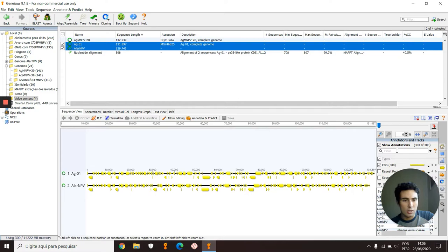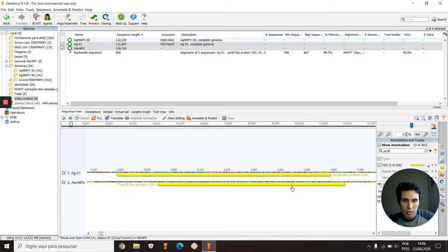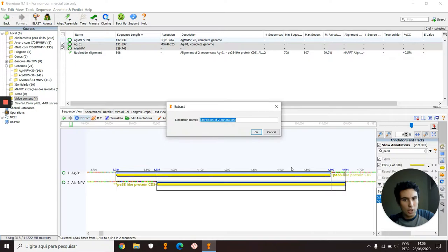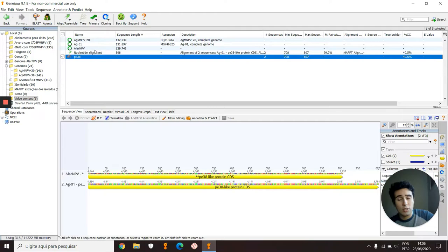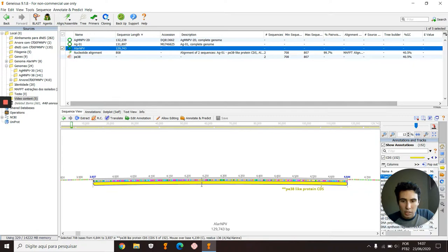Selecting both genomes that you want to analyze. I'm going to search for p38 right here, and you just select both with Control and click on both and extract p38. And that's done. They are already grouped, but I'll show right now how to group them manually.